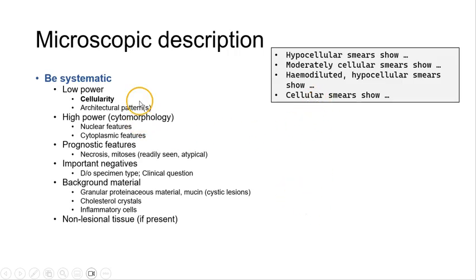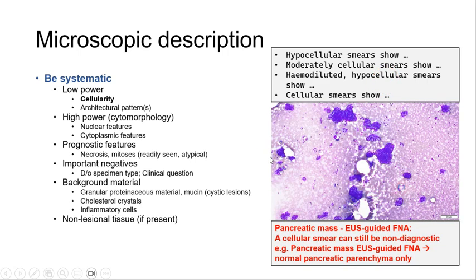Here is an example of how cellularity can be very concisely reflected — for example, hypocellular smears, or moderately cellular, haemodiluted hypocellular smears, etc. I want to highlight that in some contexts, smears can be highly cellular and still non-diagnostic. For example, here we have an EUS-guided FNA of a pancreatic mass, and although the smear is very cellular, this actually only shows normal pancreatic parenchyma, and if this is the only finding, the sample is actually non-diagnostic.